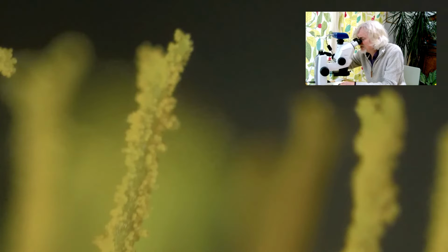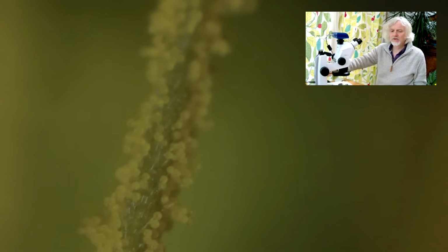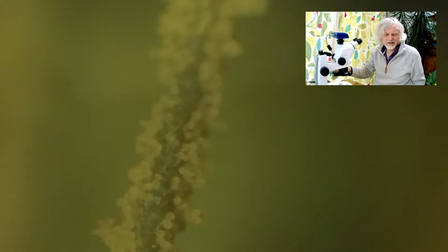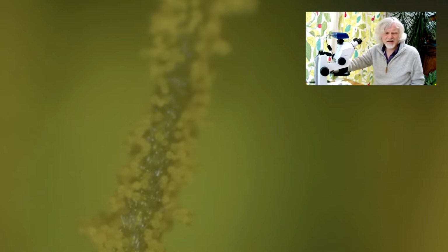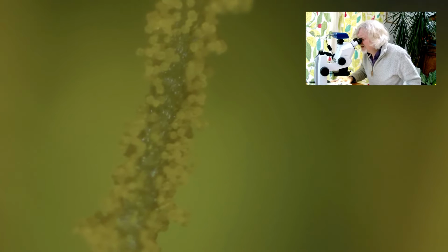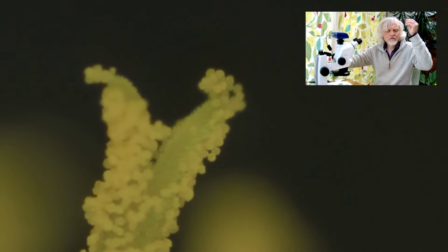But in this case, that's not what happens. The female parts actually carry the pollen, and if I zoom right in like this, now I'm zoomed in as close as we can get. I need to increase the light a little bit, and then focus this. Let's try and focus on the end of one, where hopefully we can see what's going on. That's not so good. Here, look, here's one that's just starting to split open at the tip. Okay, so that's the very tip now of the stigma.